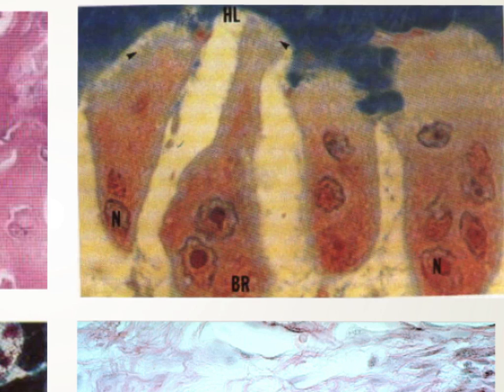So, this picture demonstrates these 4 osteoclasts. This is the bony surface, and we have here the multiple nuclei, and this cell is responsible for bone resorption and of course for bone remodeling during ossification.